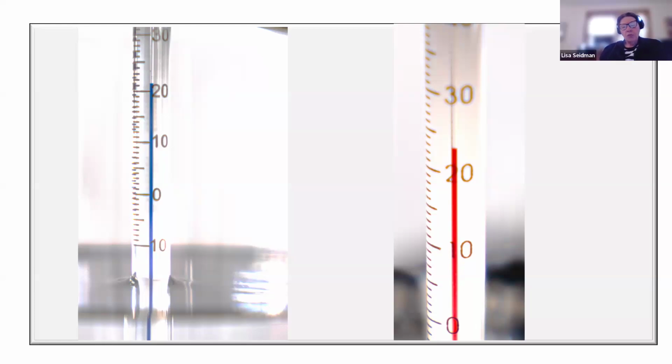And while you take a minute to maybe find a pen and take a look at those readings, I'm going to talk a little bit about how this would work with our students. They would be seeing real beakers and real thermometers, and they would be making some readings of those real things. Then I would be asking them to put their readings, what they recorded, onto the board, blackboard, whiteboard, maybe an overhead projector.